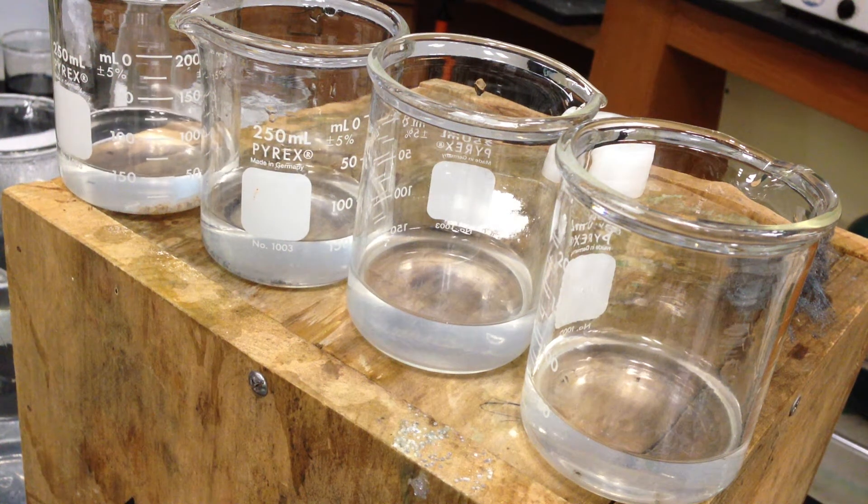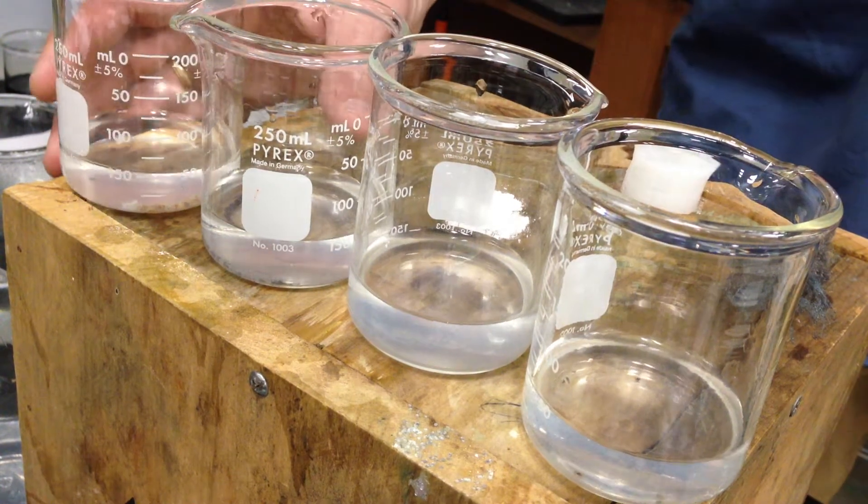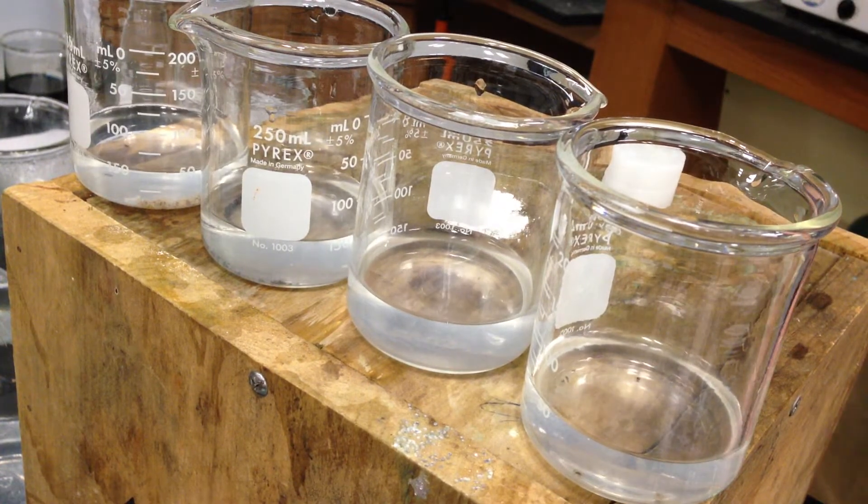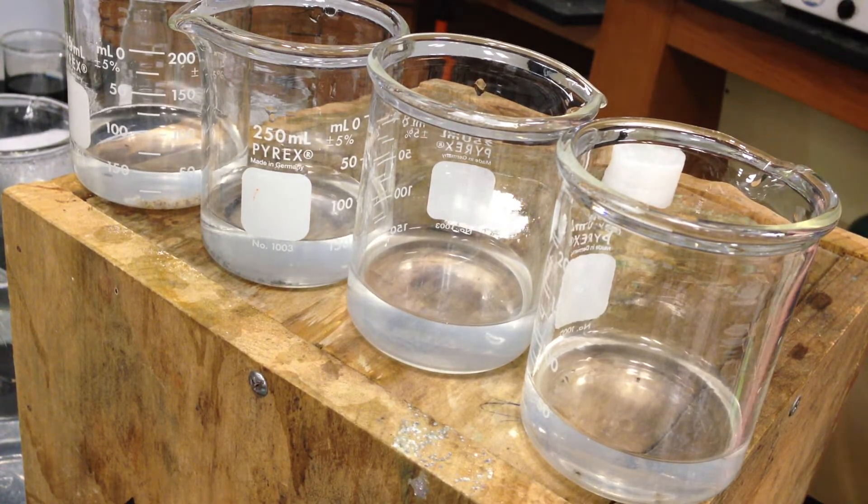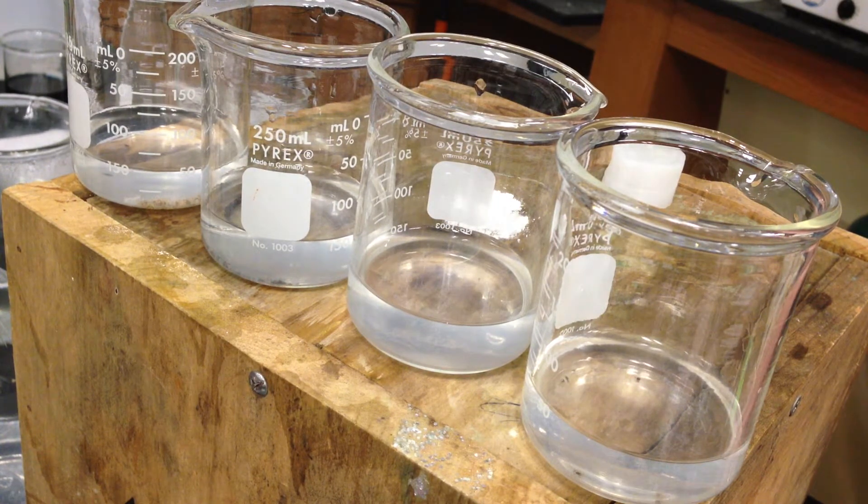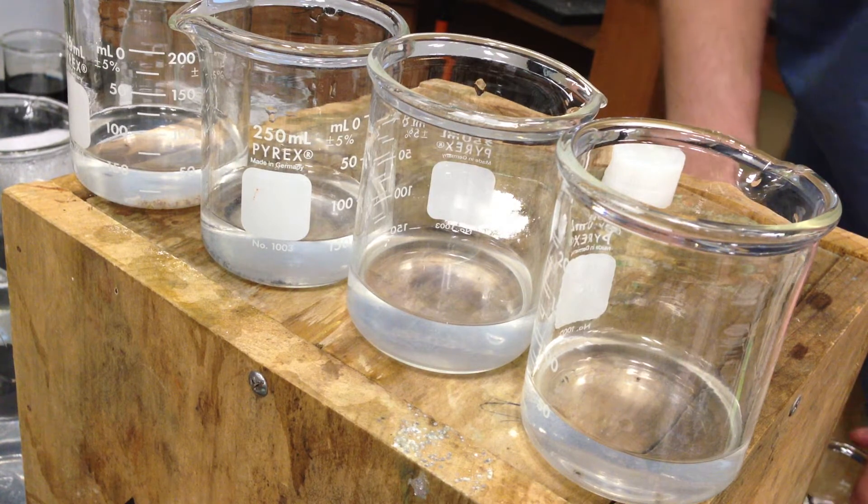Okay, so we've got some beakers here that have varying concentrations. These have the very classic starch reaction with potassium iodide. And all I'm doing is pouring solutions with varying concentrations into these beakers.